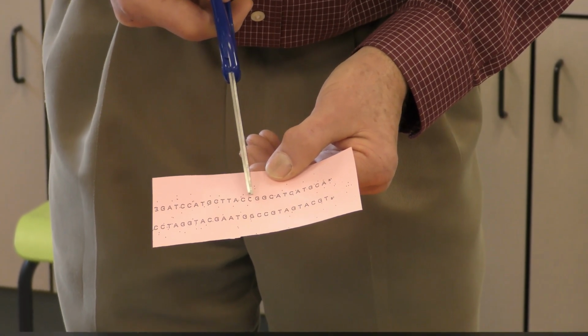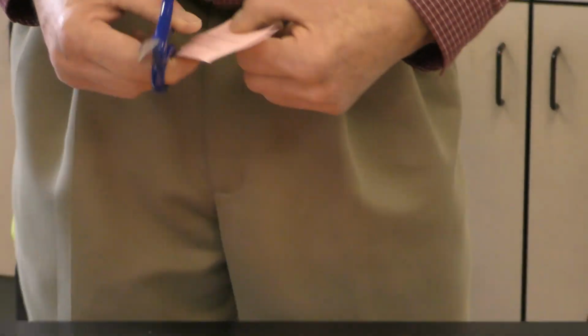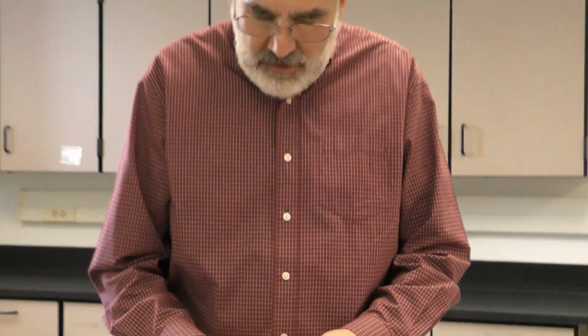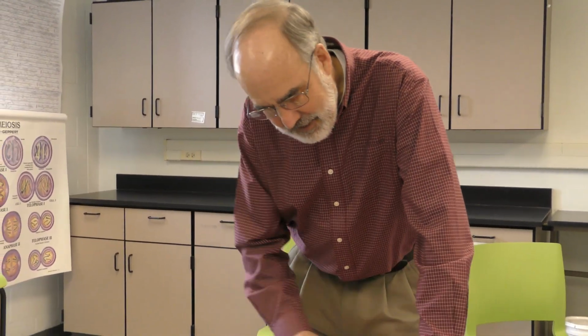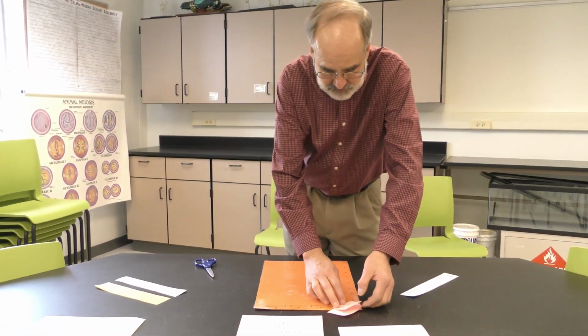Here's another one, double C, double G, and I would cut through both strands. So from that DNA, I created 5 DNA fragments, okay? Now, hypothetically, I would load all those DNA fragments in a mixture in well number 1, and they're going to separate on the basis of their size.